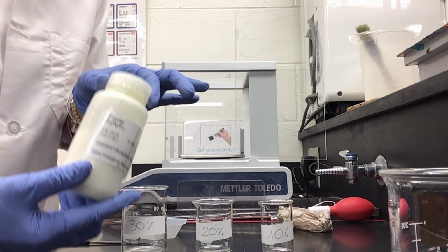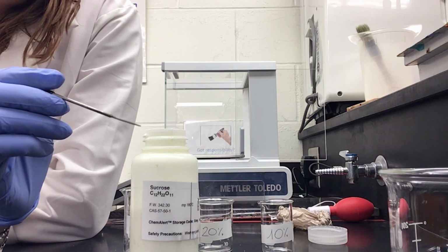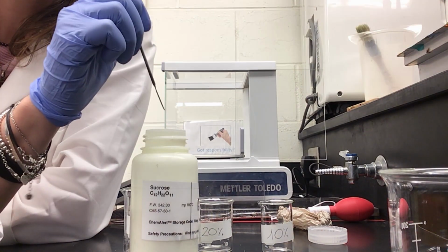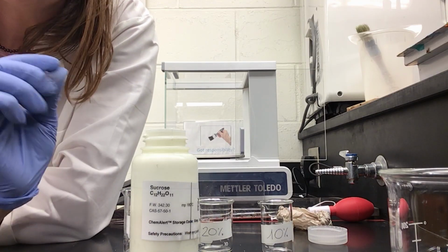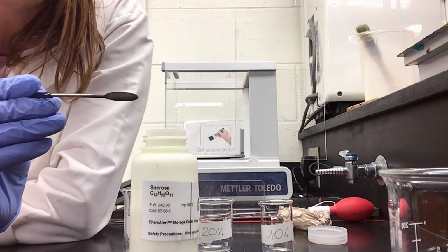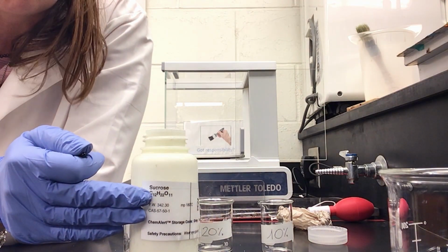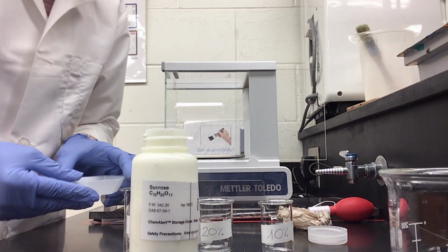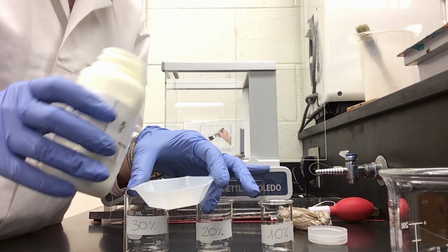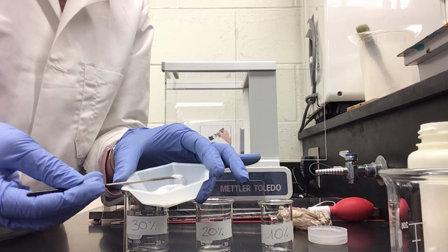First of all, you need your bottle of solid, which is the sugar. You need a spatula. Many students often make this mistake out of inexperience: they use their spatula directly in the reagent bottle. No, this is a huge mistake, because if your spatula is dirty, even if you don't see it, it might be dirty with some other chemicals. If you put it directly in the bottle, you will contaminate the content, which you don't want. So the proper way is to equip yourself with a weigh boat, drop a little bit of your chemical in the weigh boat, put the bottle away, and use this as a dispenser for your chemical.